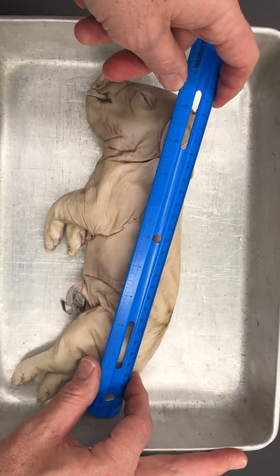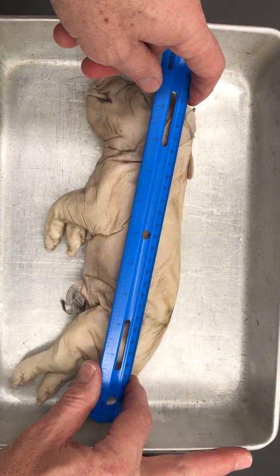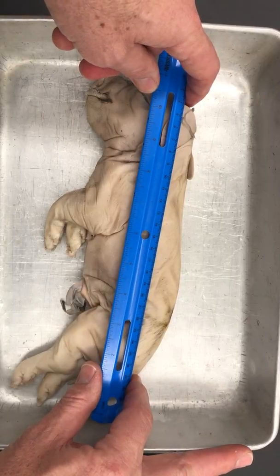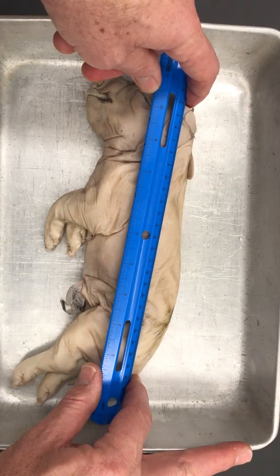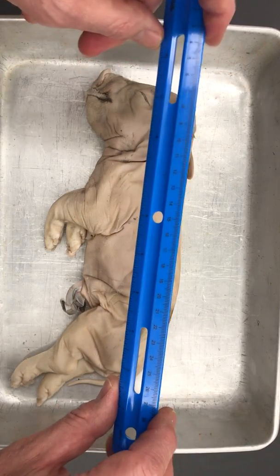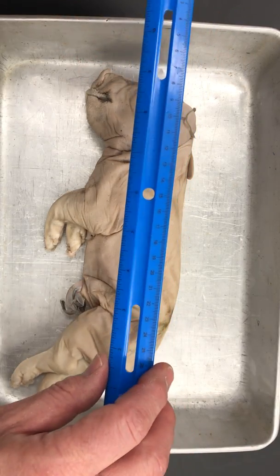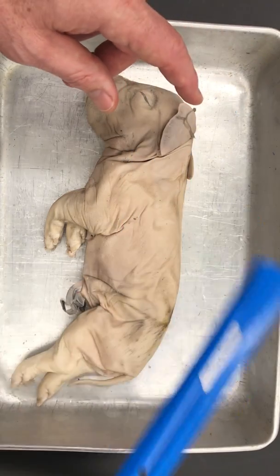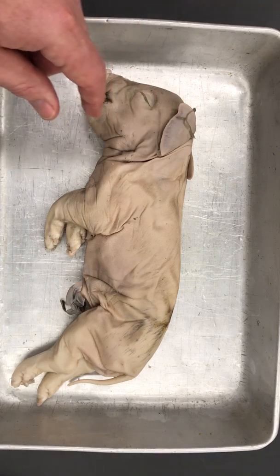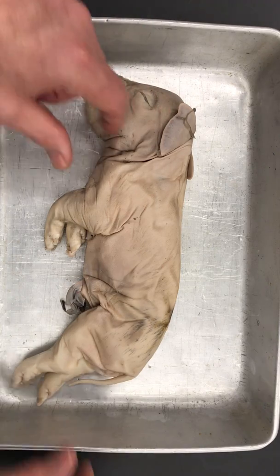So this guy is about 28 centimeters. So if you look on your sheet of paper, on your gold sheet, he's over 100 days old for sure. So pretty close to being born, all right?